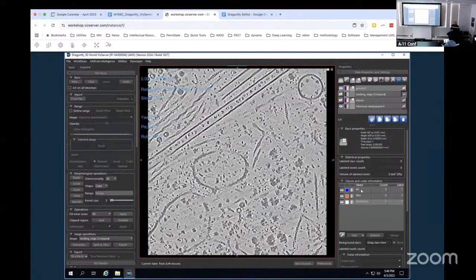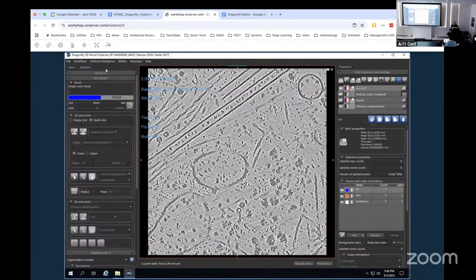All right. Select the microtubule class just by clicking on it. And then come over to the left side. We're going to minimize the ROI tools and open up the ROI painter, where we're going to select the round brush. And we'll just leave it on adaptive Gaussian. Now, when you bring your mouse back over the middle part of the screen, it should look like a brush. Does everyone see that brush? Okay.